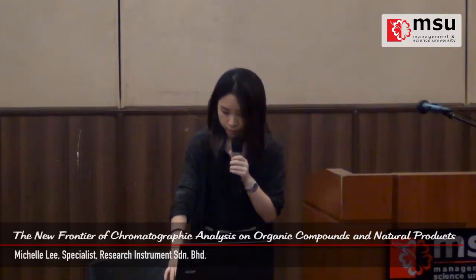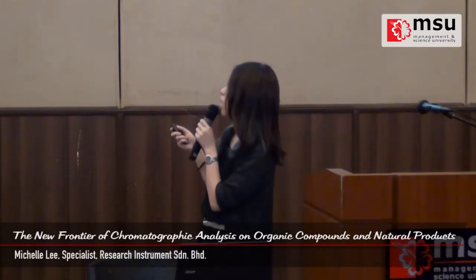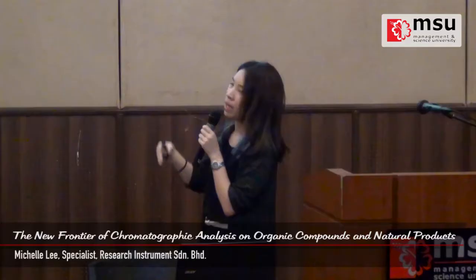You know that outside there are a lot of different kinds of chromatography techniques like HPLC or CC. But what I will share with you is that HPTLC can do similar applications as well. The most important thing is that it operates at a much lower operating cost compared to the other techniques. Therefore, the big manufacturers use TLC to do routine QC control on their products because of the lower cost. As well, the methods are much more flexible.